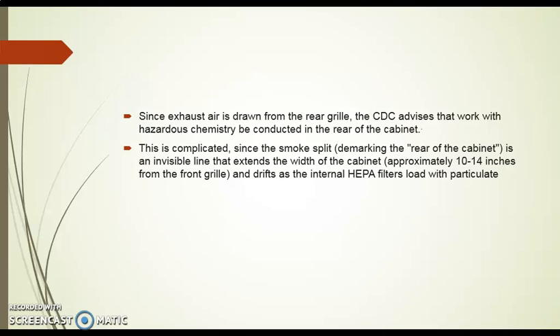Since exhaust air is drawn from the rear grill, the CDC advises that work with hazardous chemicals can be conducted in the rear of the cabinet. This is complicated since the smoke split is an invisible line that extends the width of the cabinet and drifts as the internal HEPA filter loads with particulate.